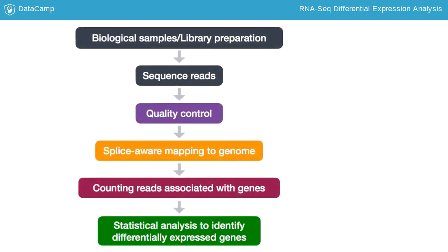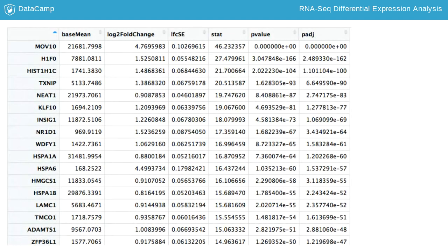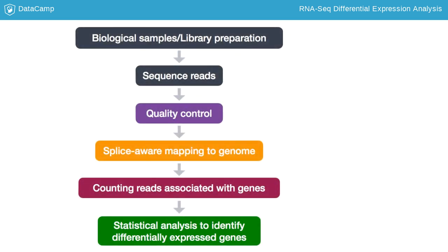Once we have the count data, differential expression analysis is performed by comparing the expression of each gene between the specified conditions. The output of the statistical analysis includes the log2-fold changes of expression between conditions and the adjusted p-values for each gene. Genes that reach a threshold for significance can be subset to the final list of significant differentially expressed genes. Now that we have a general understanding of the workflow and have the counts file loaded, we can get started.